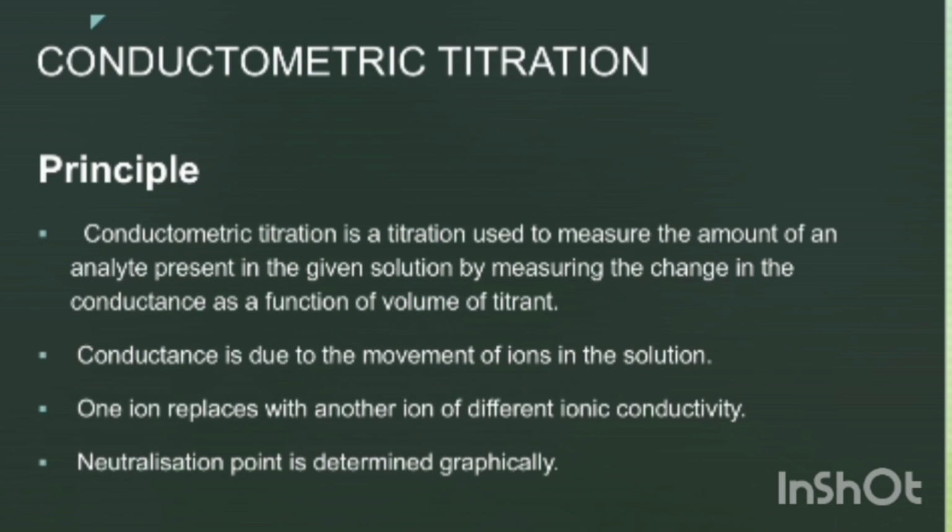Here, the conductance is mainly due to the movement of ions in the solution. In the titration, one ion is replaced with another ion of different ionic conductivity during the titration, and the equivalence point is determined graphically.